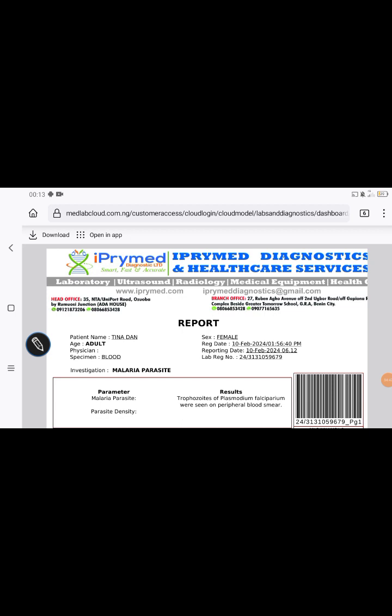So if the patient has fully paid, he can log online through our link and download his report, and he cannot edit it. It's just a PDF copy, and they can use it for the investigations, to complete their health checkup or treatment.